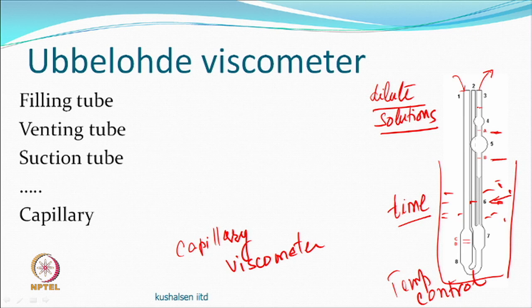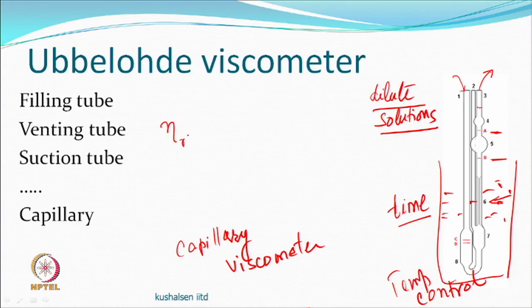This flow also depends on concentration, at whatever concentration you have, since you are looking at a solution which may have a different density. So, the viscosity ratio is also related to time and density of the solution or the solvent.